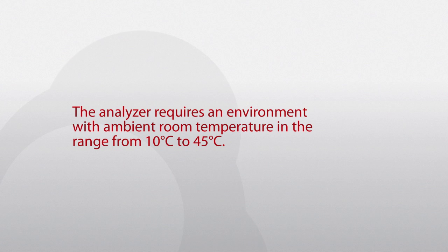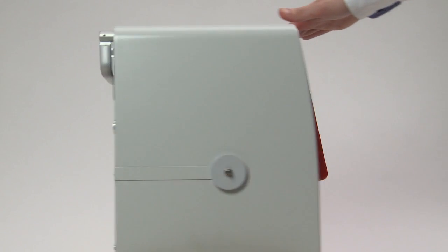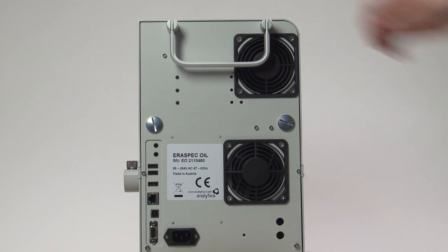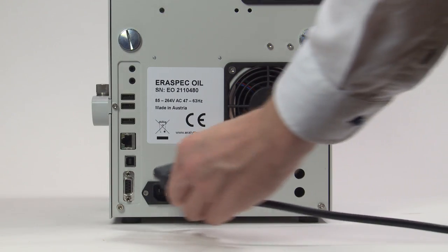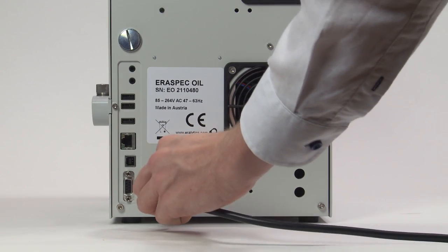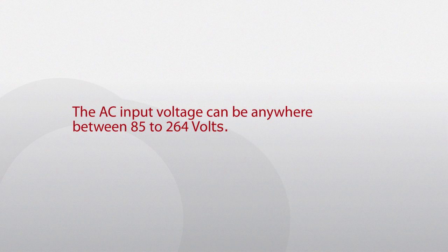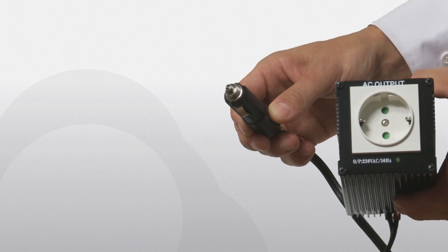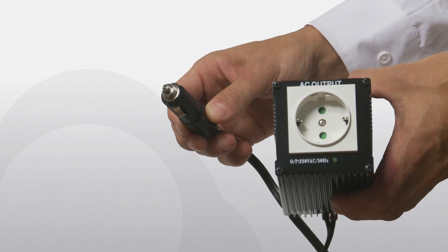Turn the instrument on and connect the power cable to the plug on the rear side of the instrument. The AC input voltage can be anywhere between 85 and 264 volts. If the instrument is used in mobile laboratories or in the field, it can also be operated at 12 volts DC using a DC-AC converter.